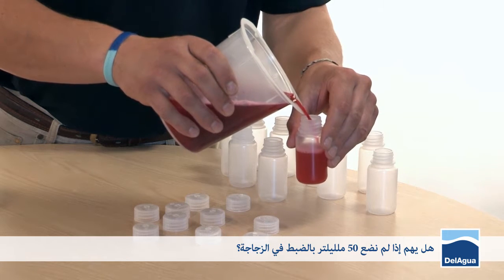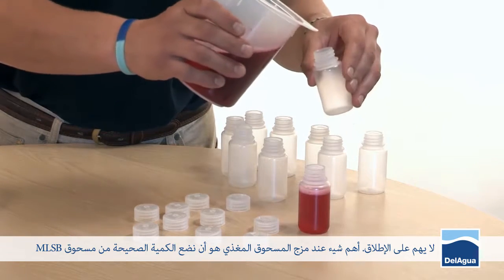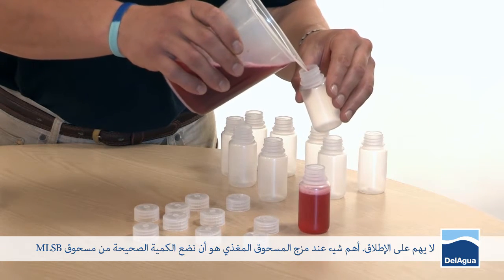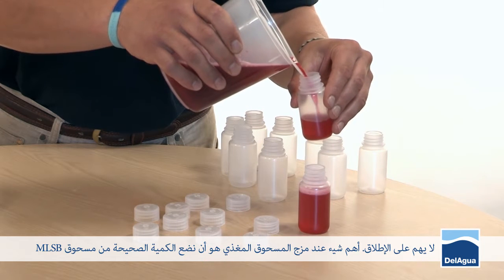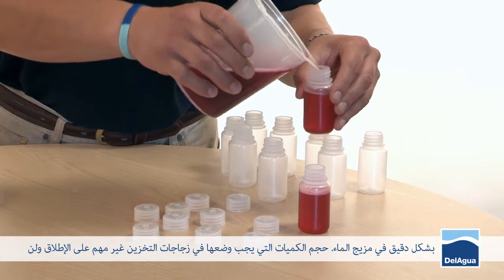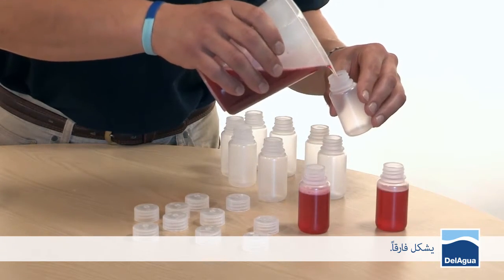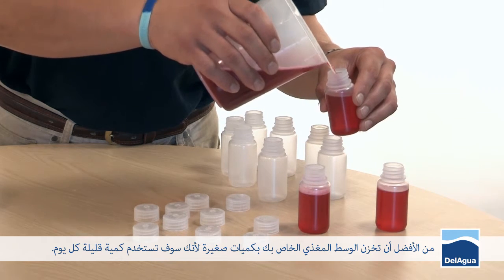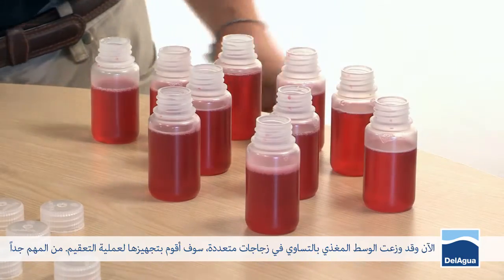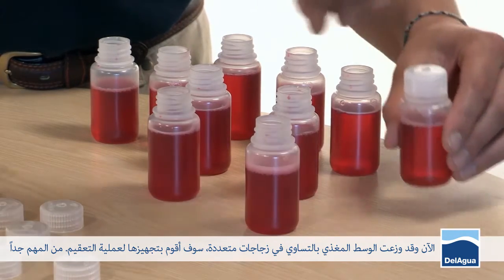Does it matter if it's not exactly 50 mils? No, not at all. The important thing with mixing media is to get as precise a volume of MLSB powder to the water mix; what volumes it's subsequently stored in doesn't make any difference. It's better to store your media in small volumes because you're only going to use a small amount each day. Having evenly distributed the media into the various bottles, I'm now going to prepare them for sterilization.